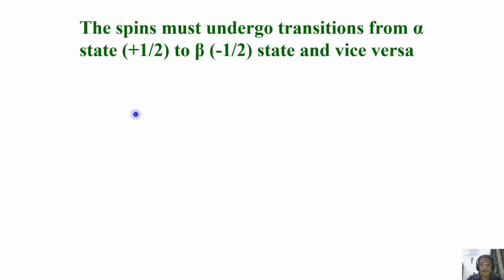But now we have to see the resonance. That means we have to see the NMR peaks. NMR spectrum we have to see. How do you see that? We have to induce what is called some resonance. Okay, what is that resonance? When two frequencies match, you call it resonance. Now, how do you induce resonance here?